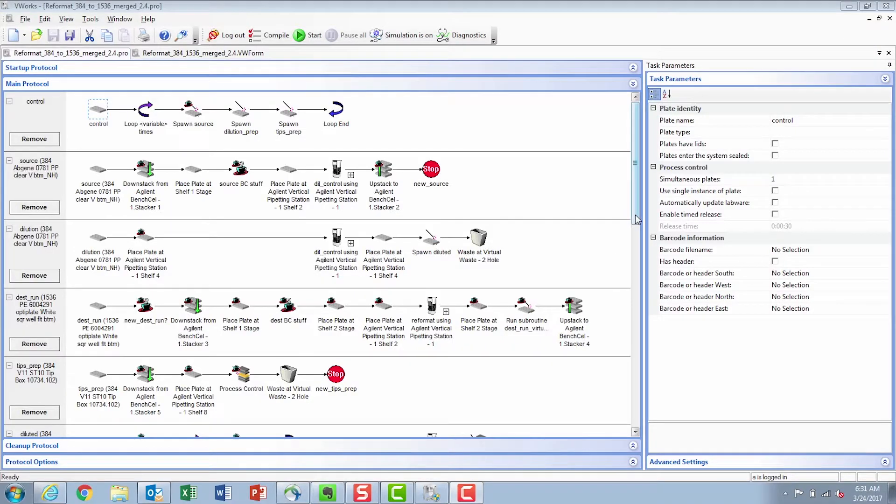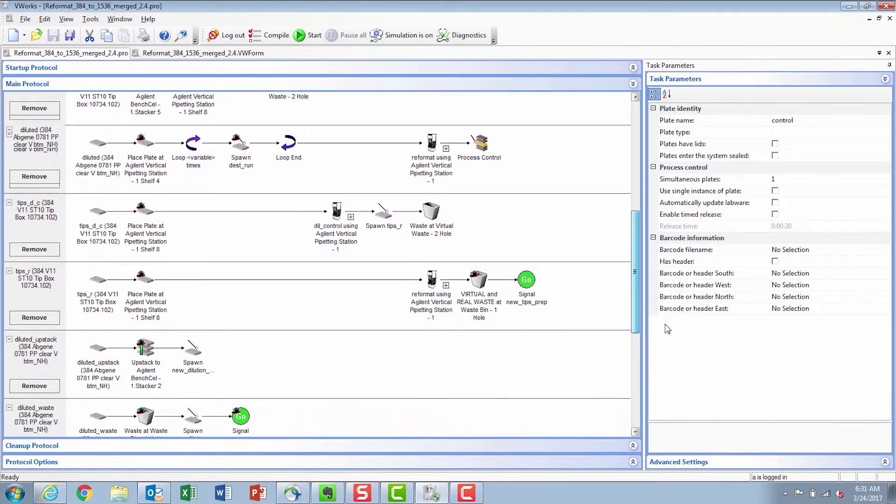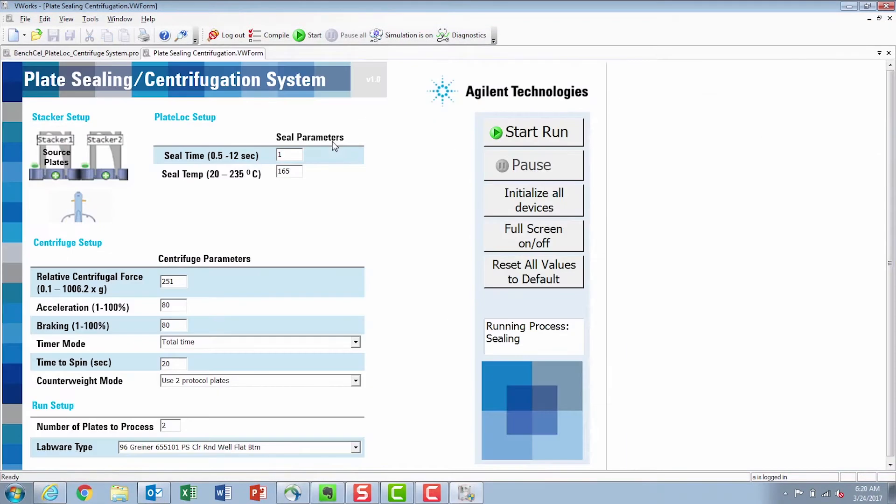Additionally, on the other end, you can put additional devices to add more functionality to your workflow. The system is controlled by our vWork software, which is designed to give you an easy interface to be able to create protocols that meet your needs. For new users, we've also put in some new forms that give you basics to start with.